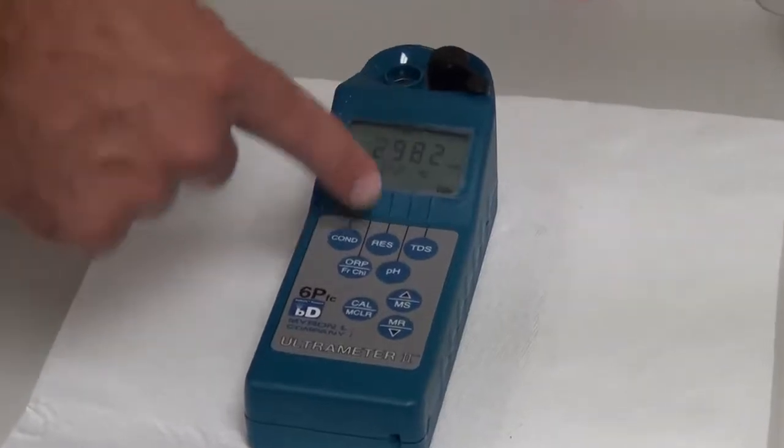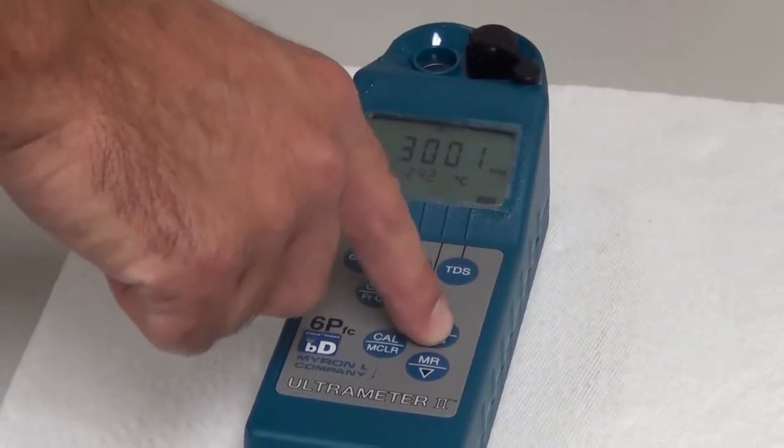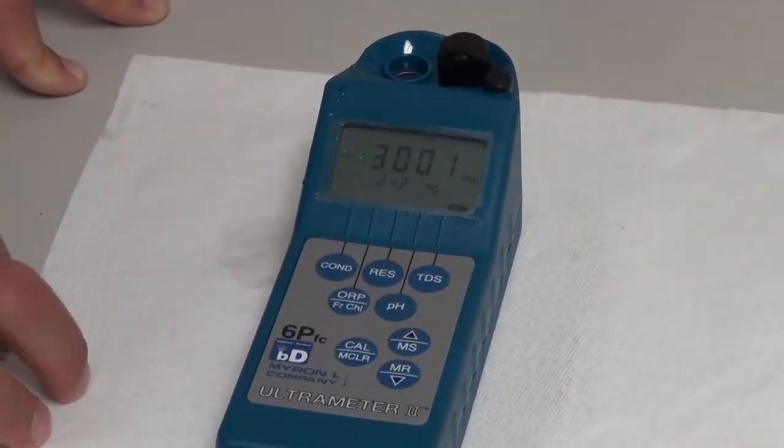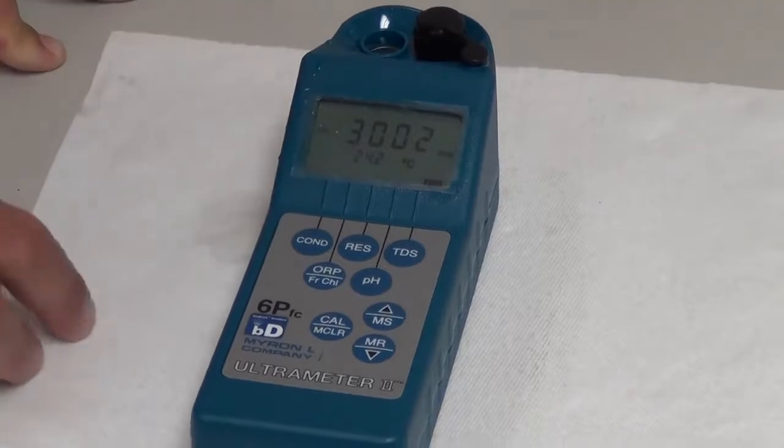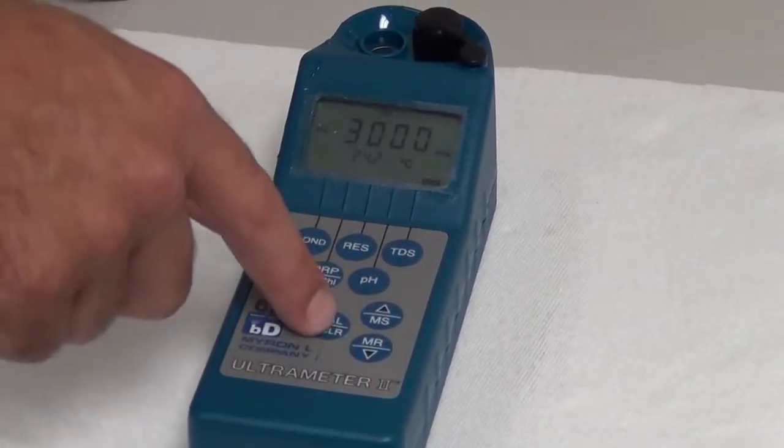So I'll hit my cal button. See, it says cal across the top. Going to arrow up to 3000 ppm. I'm going to hit enter or cal again. You'll see that it may bounce around by one or two digits. That's okay. Put that down. 3000.